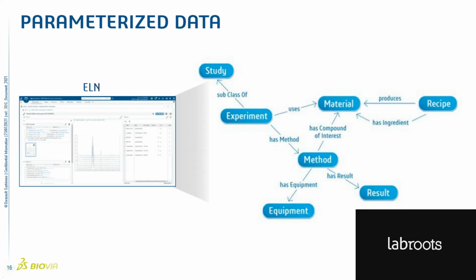So if you could automatically extract and parameterize the data as it's entered into the ELN, that opens up a world of possibilities to use the data in other ways, either immediately or as part of data science initiatives on larger data sets.